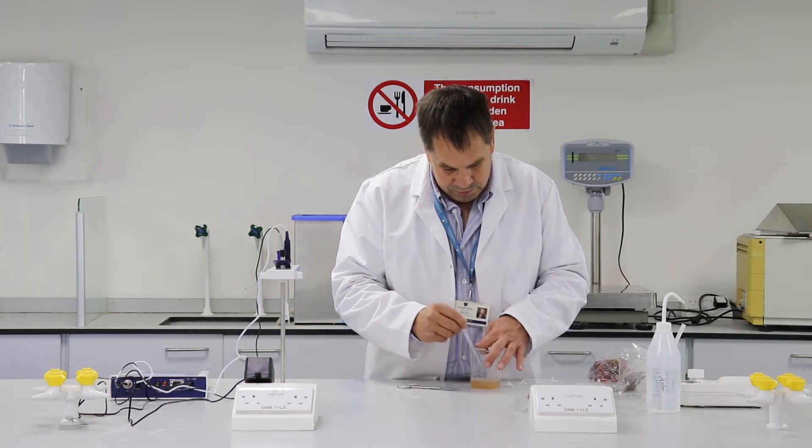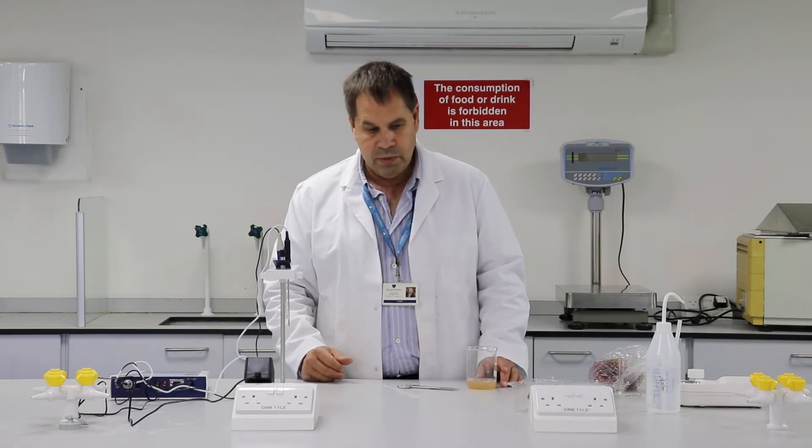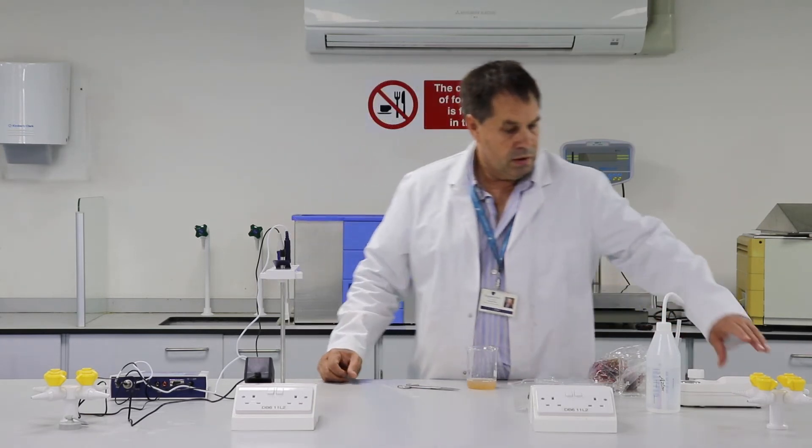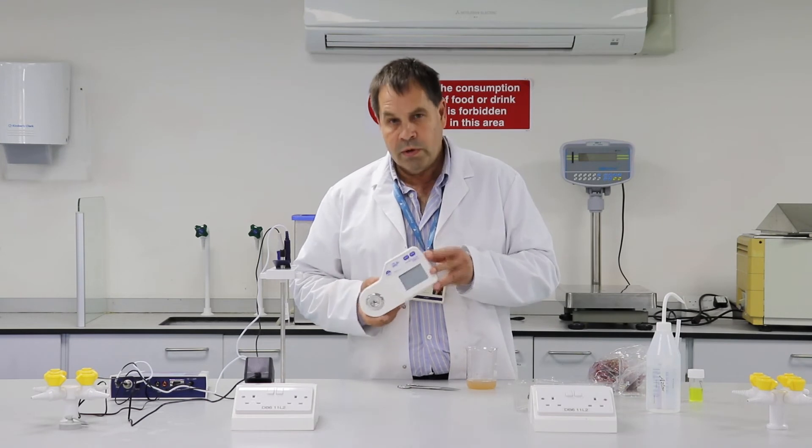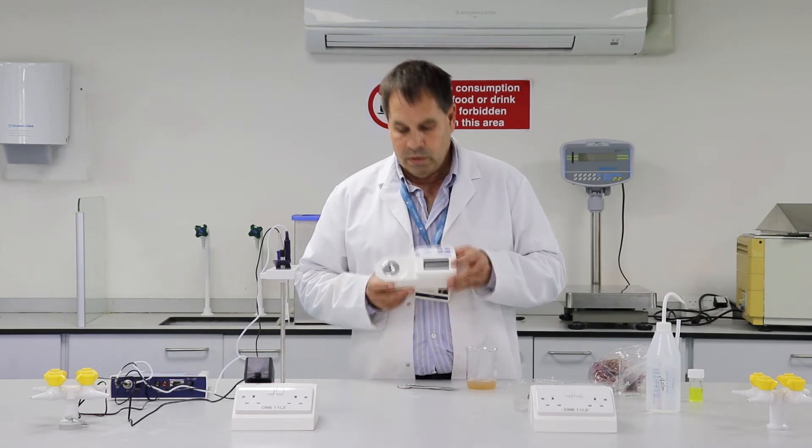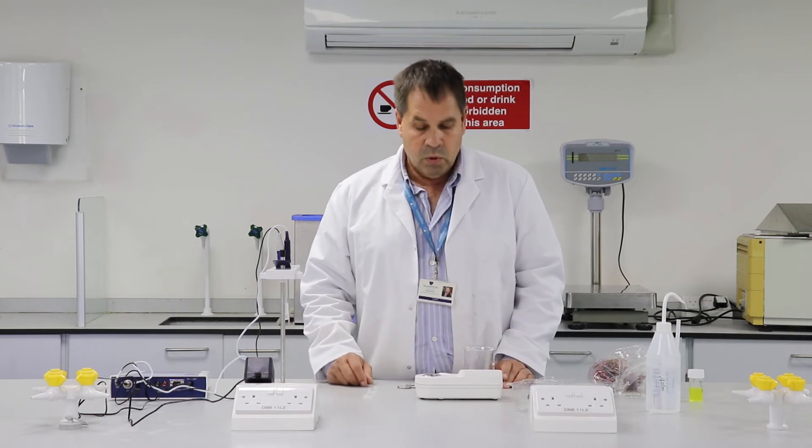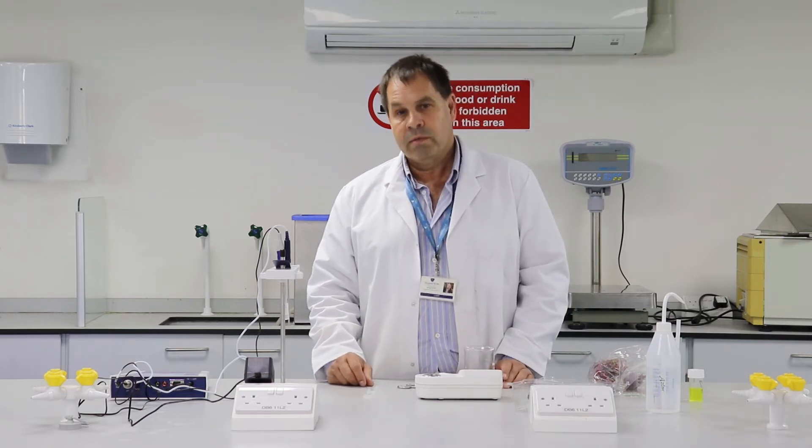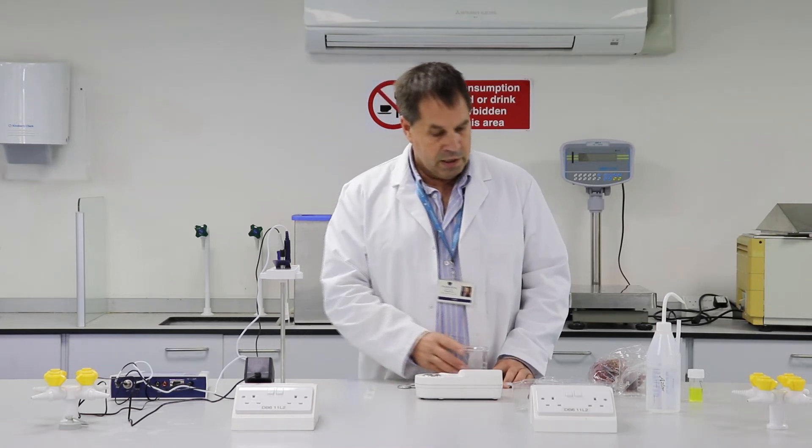Normally I would filter this through muslin, but for the purposes of today's demonstration we'll just measure it unfiltered. What I have here is a digital refractometer and this is what we use to measure sugar. The way it works is that the more sugar in the solution, the more it will bend a beam of light. So the higher the level of sugar in the solution, the more the light actually bends.